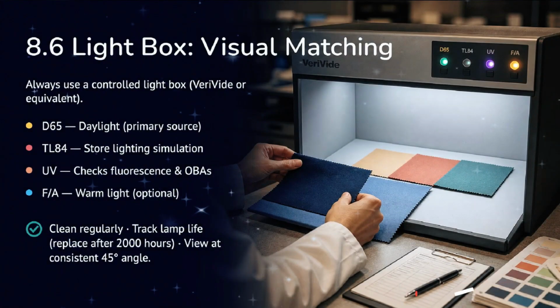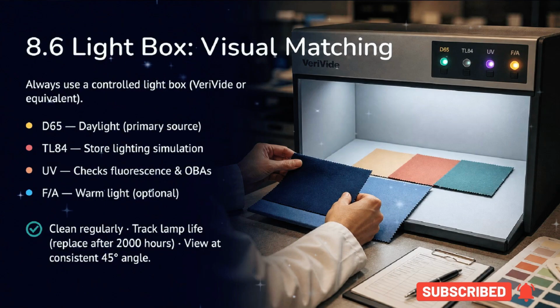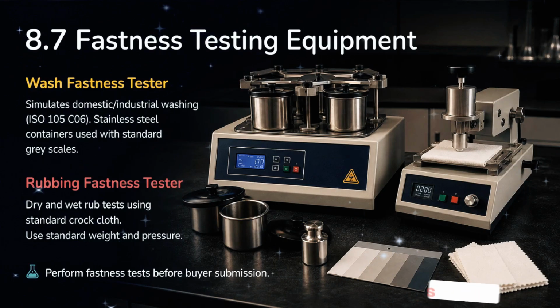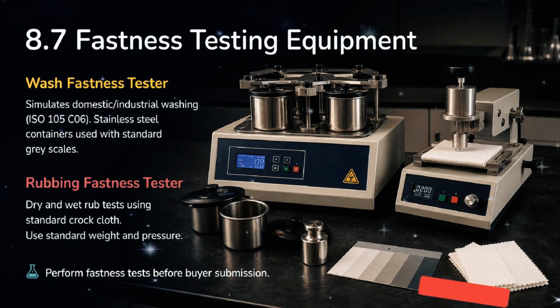Use a light box for visual matching. Use D65 for daylight, TL84 for store lighting, UV to check fluorescence, and F/A for warm light. Remember to clean regularly and replace lamps after 2,000 hours. Fastness testing is vital. Wash fastness testers simulate domestic or industrial washing, while rubbing testers check durability against friction. Always perform these tests before submitting samples to a buyer.